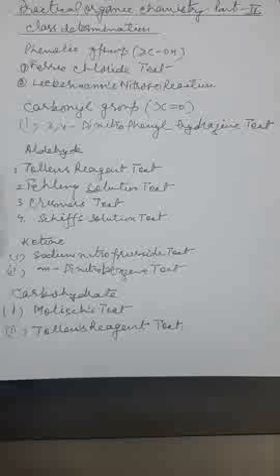The reaction is C6H5OH plus FeCl3 gives violet color. Di and trinitrophenols, meta and para hydroxybenzoic acids, and tribromophenol do not produce the characteristic color with FeCl3, while alpha naphthylamine gives a blue color with FeCl3.